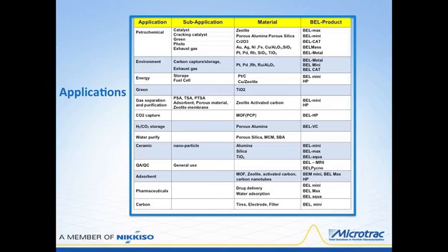And then down here, as I jump down, we can look at pharmaceuticals. And keep in mind that every time a particular drug or medication is taken, the whole purpose of that is to be absorbed by the body. That absorption rate is controlled by the particle size and the surface area of the particles.